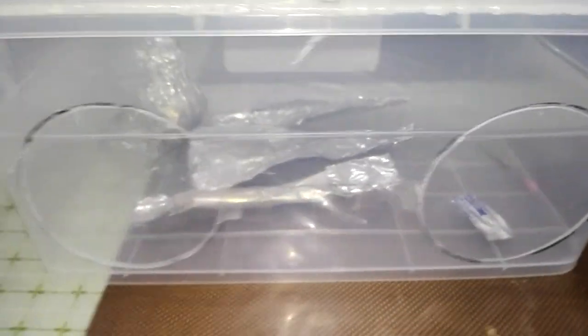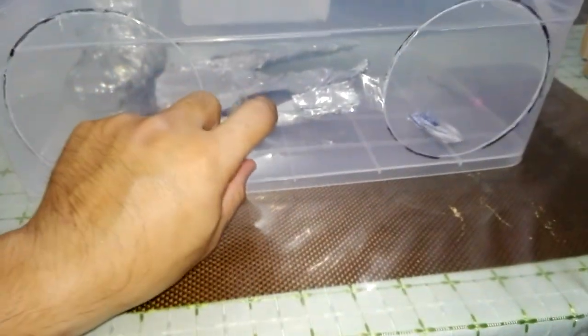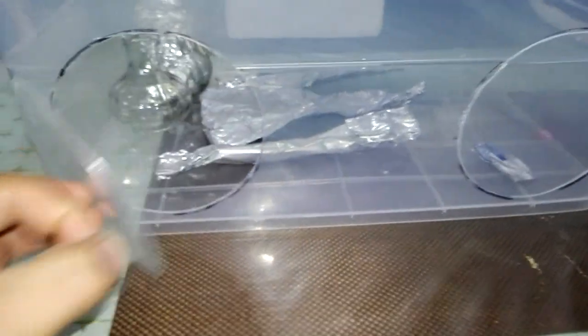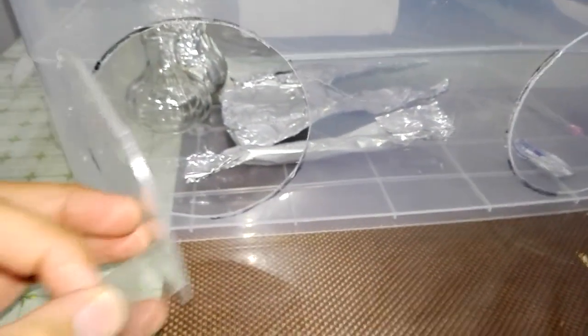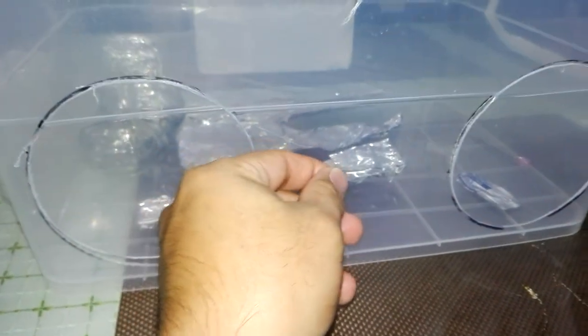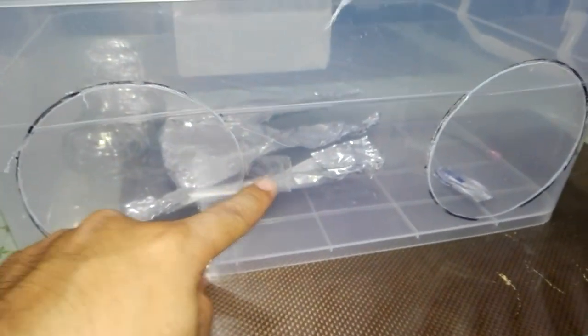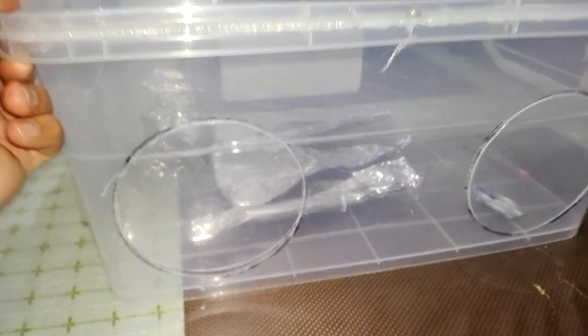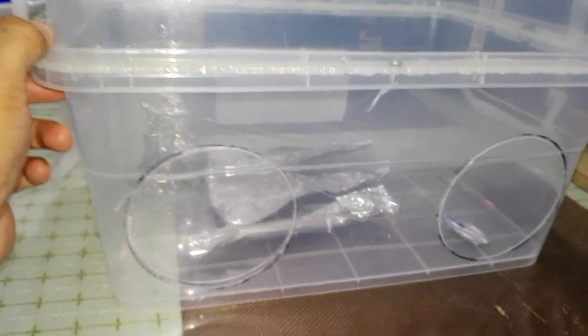This is the glove box that I made. This is where I transfer the seeds inside the flask, so to avoid contamination you have to have a glove box.